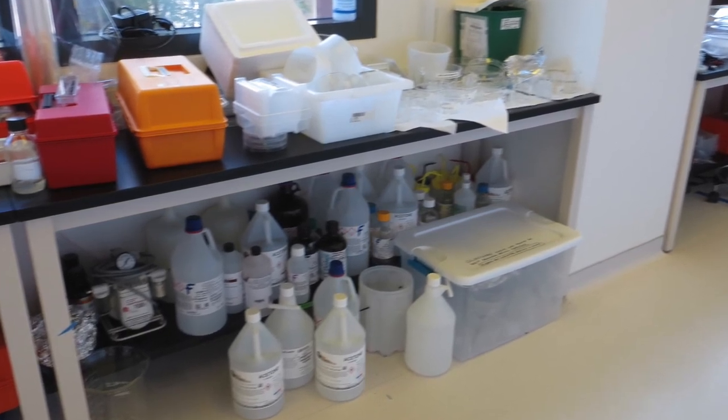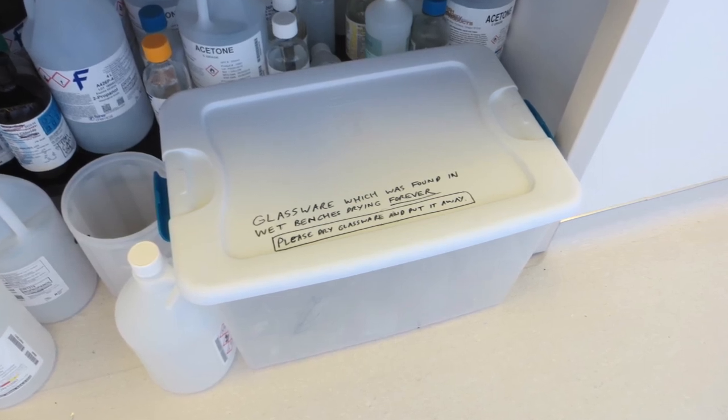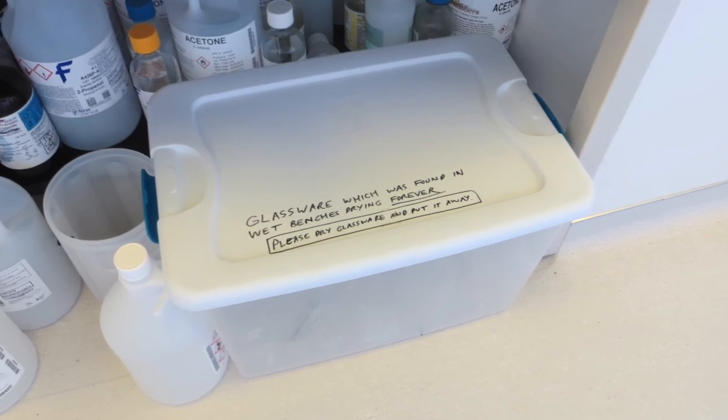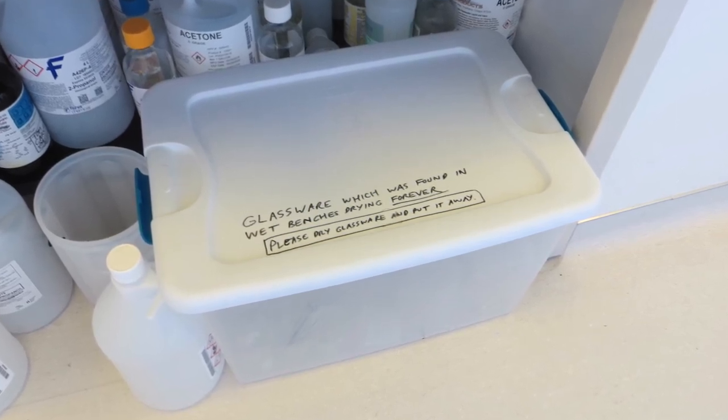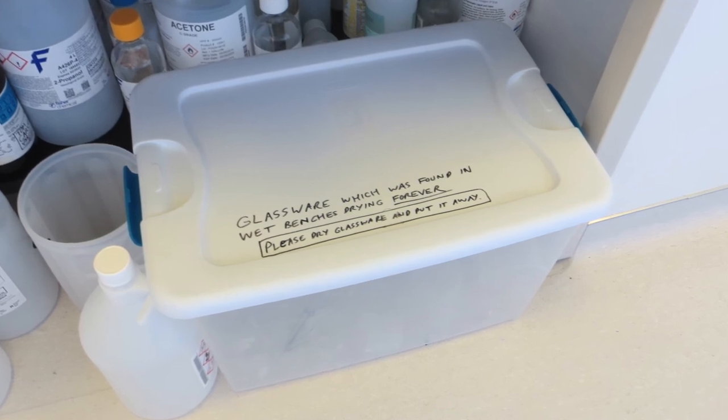Sometimes people leave beakers to sit out to dry and then they usually forget all about them and they sit there for days or weeks. So when that happens I usually take them and put them in this big white plastic bin that's just outside of the yellow room. Behind that bin are a bunch of empty bottles that I keep around just in case we need them for getting rid of some hazardous waste.